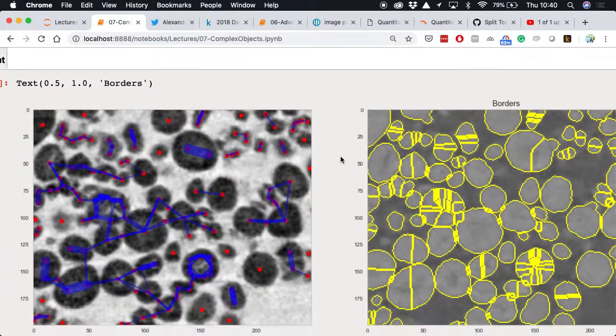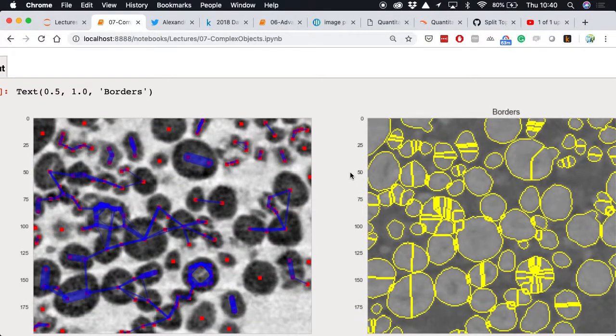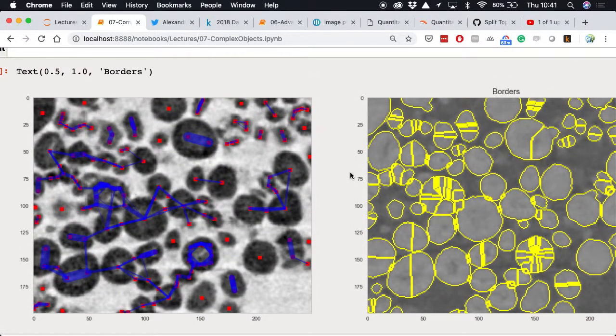We can also take this and start to represent it as a graph to go to the more material science applications, where we can now see which of these nodes are actually connected together and what the connectivity of different nodes is inside the system. And so we can start to draw each one of these dots as a vertex, and then all the ones that are connected to each other as edges. And so we see this one isn't connected to anything. These two are connected together because they're split in half. That's what you'd expect. That graph isn't very meaningful.